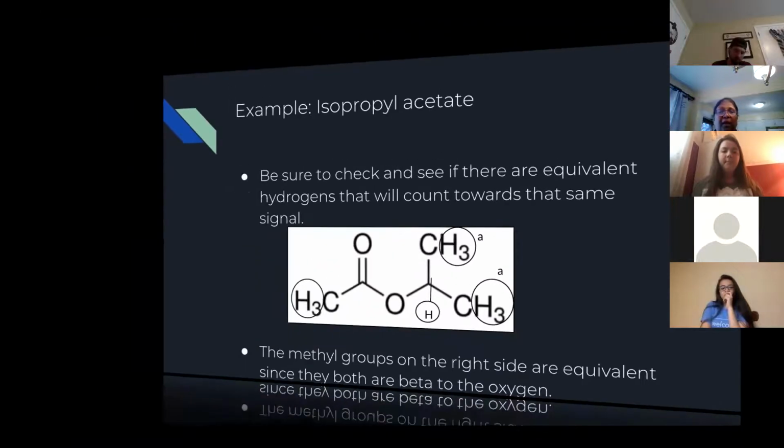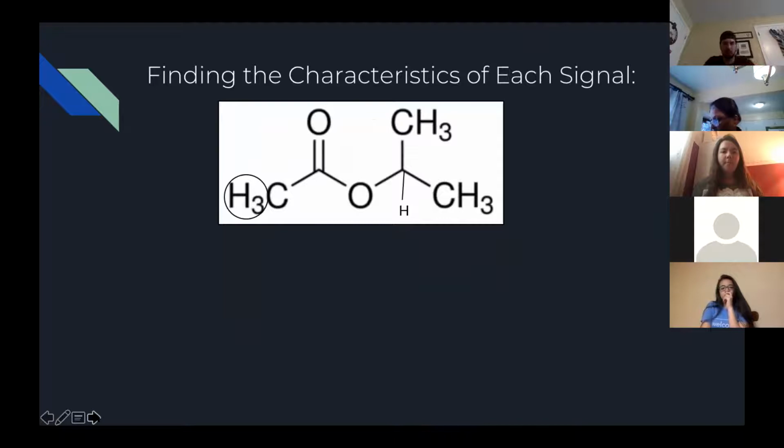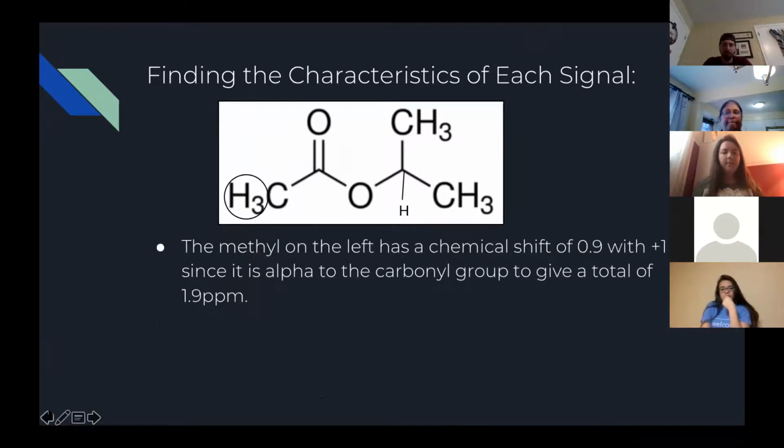Okay. So what Michaela is doing, I did a rough graph for the ethyl alcohol. She's going to specifically show you where the chemical shifts are. I think you did examples like that before with Jamie, so she's going to review that. First, I'm going to go through the chemical shift, the integration, and the multiplicity of each signal, one by one. So first, I'm just doing this methyl group right here. If you look at that little chart that you have.